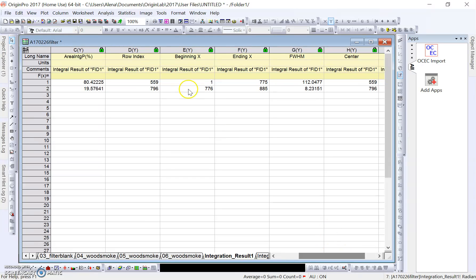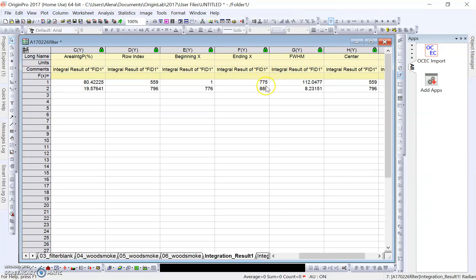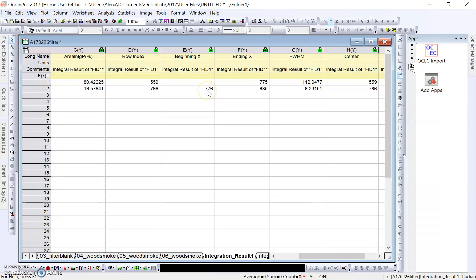As we can see looking over here, beginning X, that's just the time, so one second in this case, and ending X, so it ended at 775 seconds. Then the second range, as I said earlier, 776 seconds to 885.